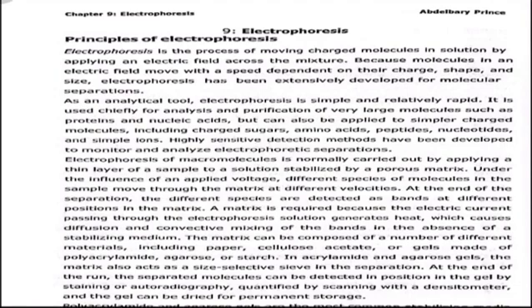Because molecules in an electric field move with a speed dependent on their charge, shape, and size, electrophoresis has been extensively developed for molecular separations. As an analytical tool, electrophoresis is simple and relatively rapid.